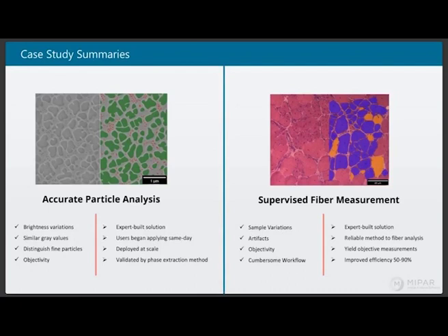I do want to commend NASA on their low KV imaging technique. The specifics of it are referenced in the paper, and we'll be sure to include a link to that paper in the follow-up email from this webinar. I know it involved minimal to no etching, low KV electrons, a scan rotation of 180 degrees and frame averaging. That really gave some of the best gamma prime images I've ever seen, and I have had experience working with many different prep conditions. There's very strong confidence in where the boundaries lie. Now we just needed the algorithm to find them reliably, and we were able to provide that.